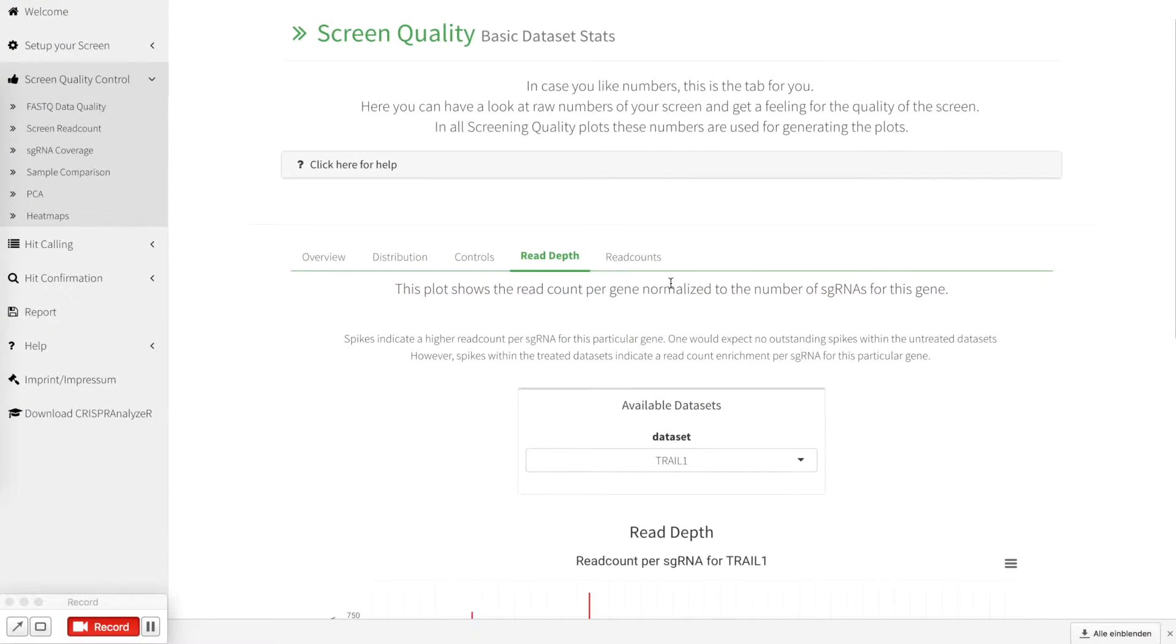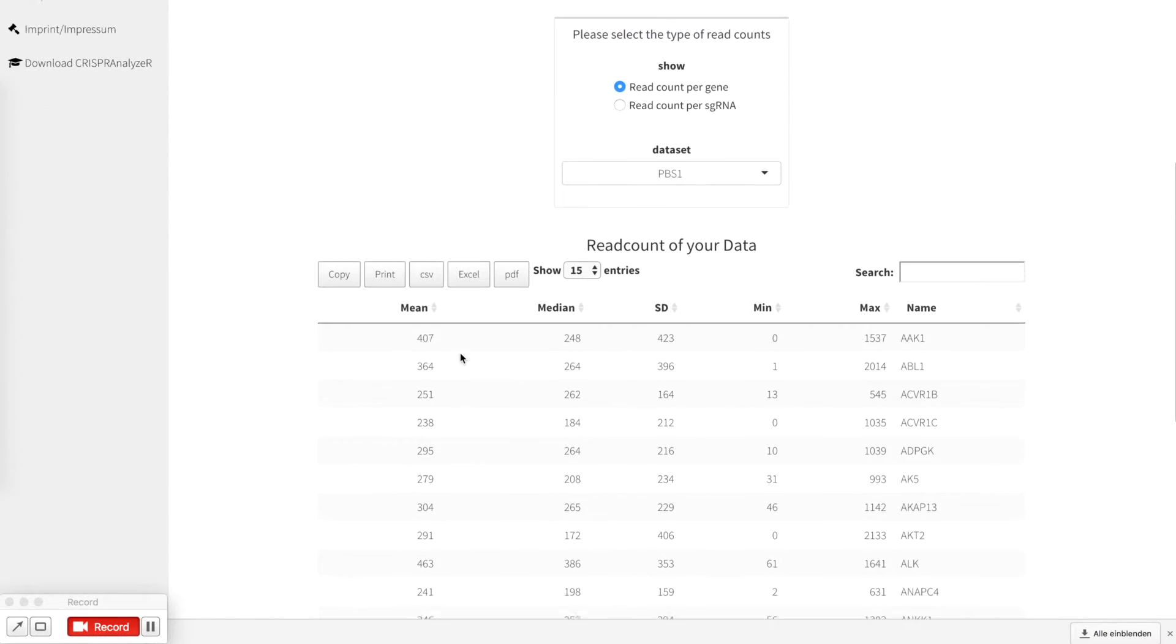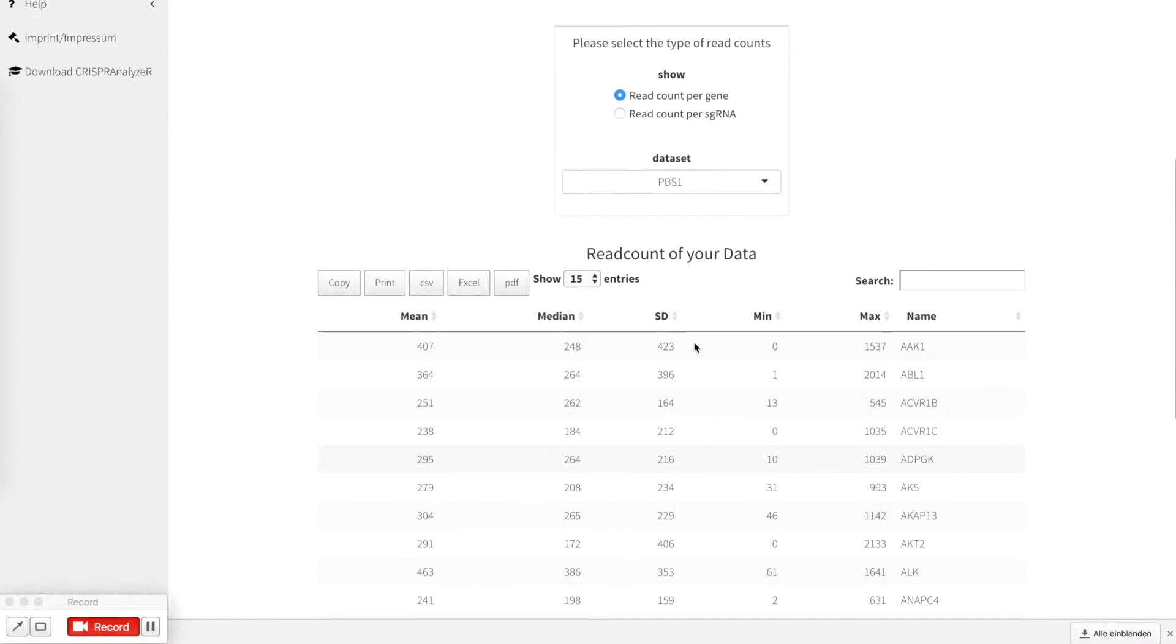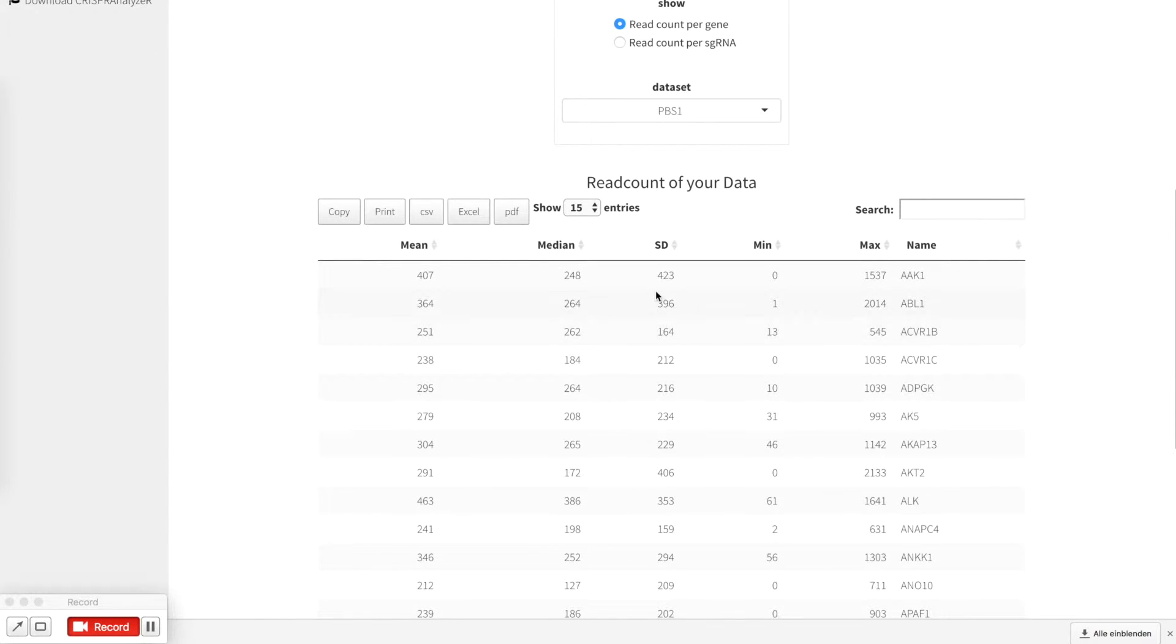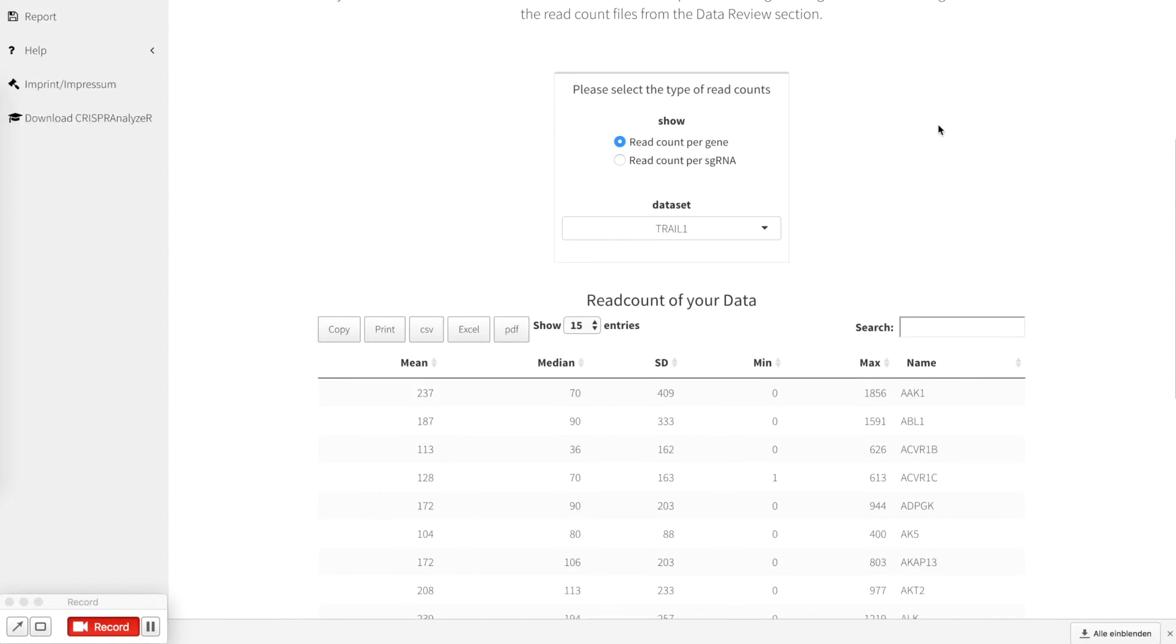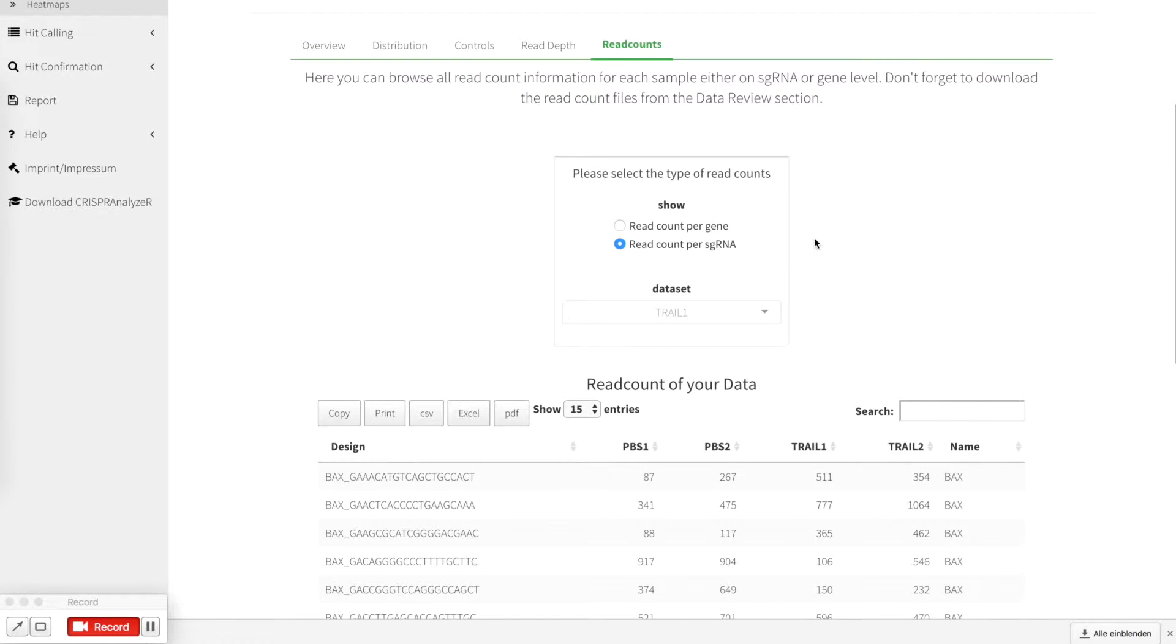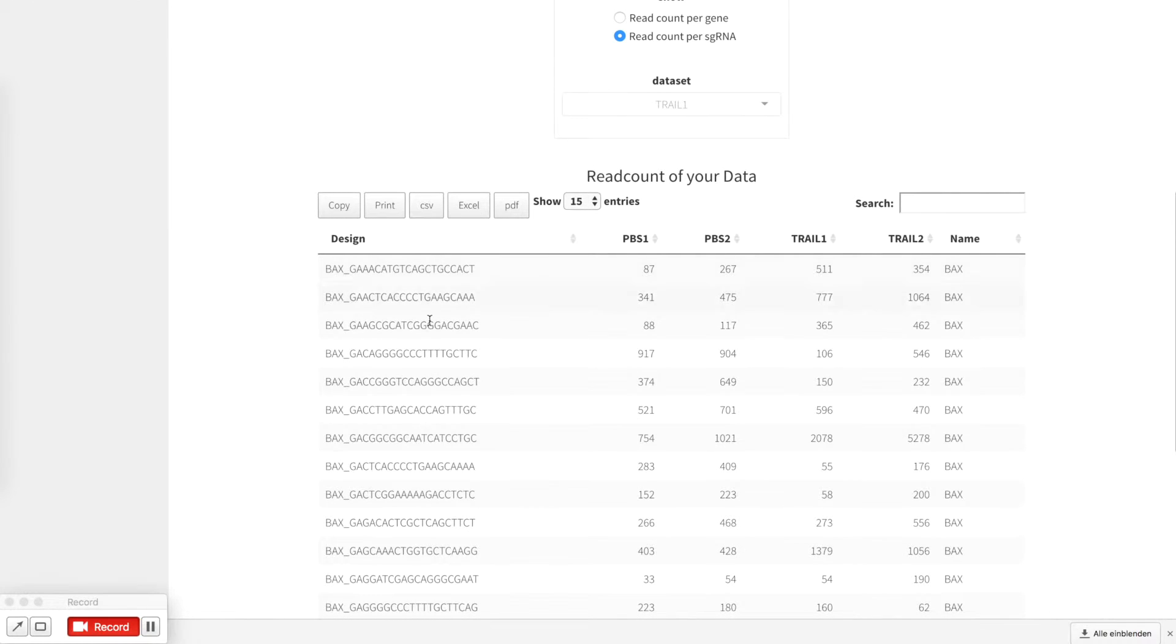As a last step there is the read count section where you can actually browse through your read count raw data in a more convenient way. You can select the read count per gene where you can also select the data set or you can look for sgRNA information. So you can see every sgRNA and the read count for each of the data set at once.